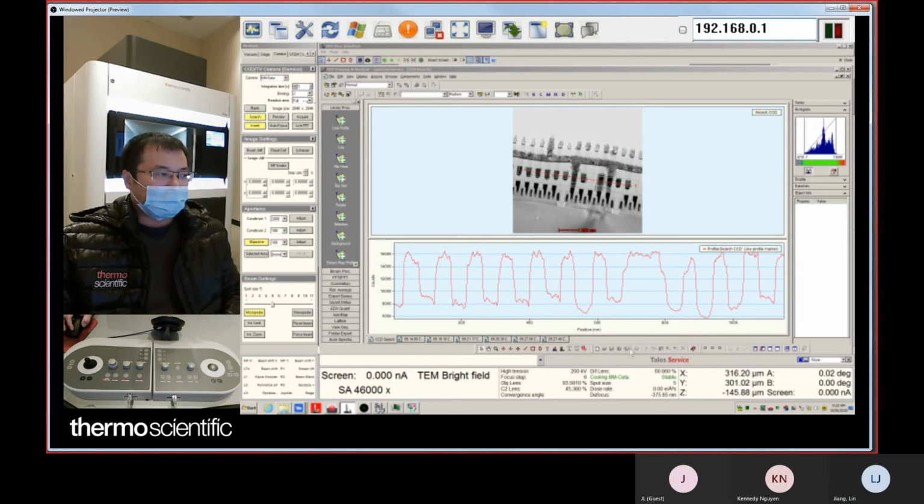Okay. So if you're binning 2, your max count is 8,000 multiplied by 4. If you're binning 4, your max count is going to be 8,000 multiplied by 16. Okay, this is a couple of ways. How do we use the camera safely? How do we make sure we improve the contrast while keeping the camera in a safe exposure range?